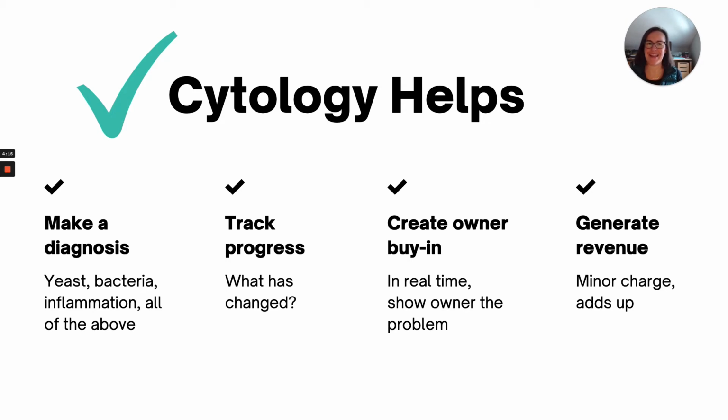Maybe not smelling. I tend to not be, it smells like yeast, and we can talk about that. But cytology definitely helps you actually make a diagnosis and visualize the problem. And it's pretty easy to do once you get the hang of it and once you have your system down, so that it's a very efficient part of your day. And also you can train your technicians to do this.